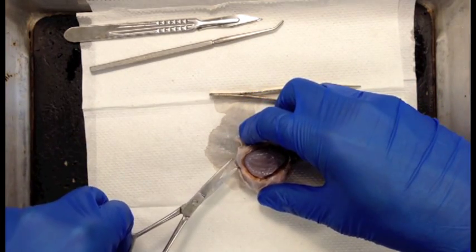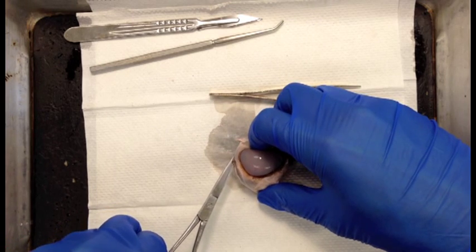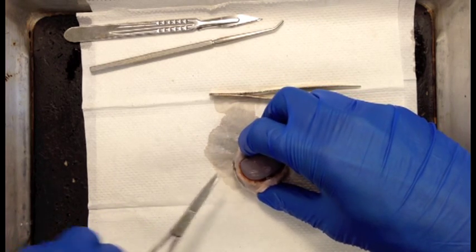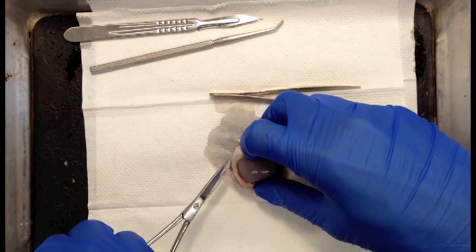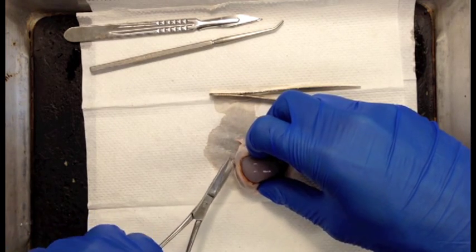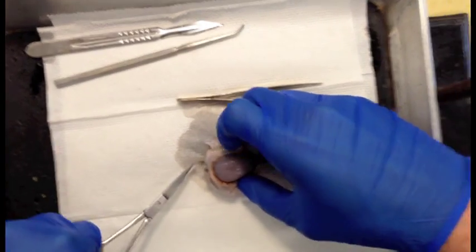frontal section, just behind the cornea. You can see the scissors go in. And as I start this, you'll see some clear fluid. Sometimes it's a little black because it has pigment mixed in. Some clear fluid pouring out. You can see a little bit pouring out there.